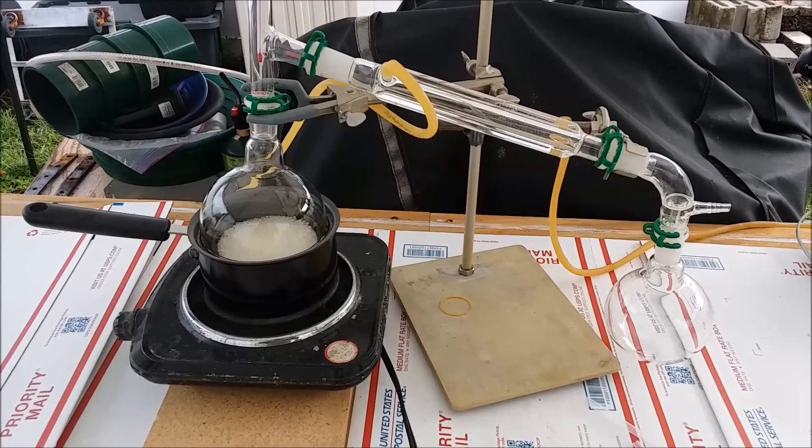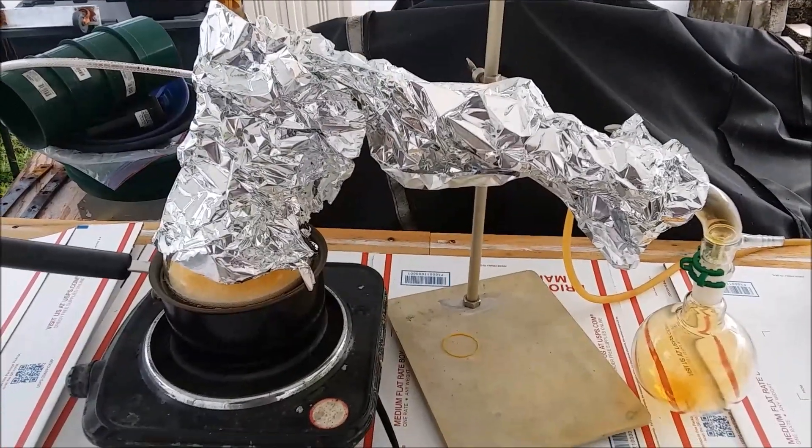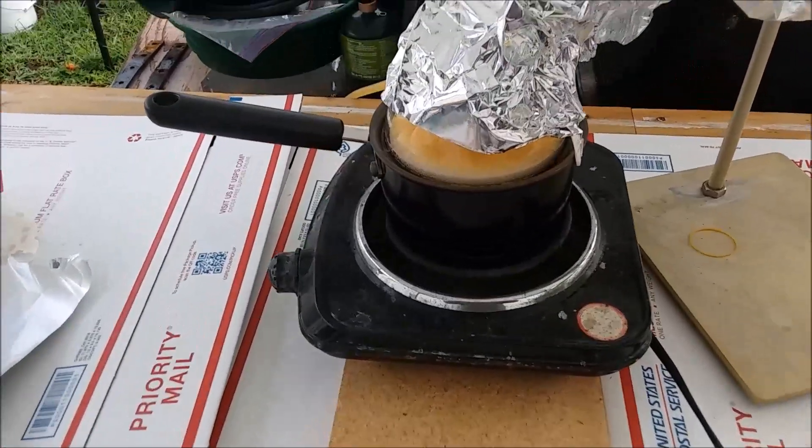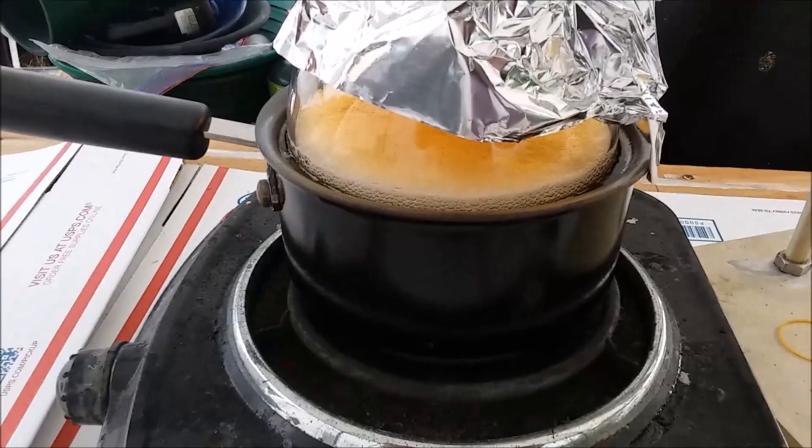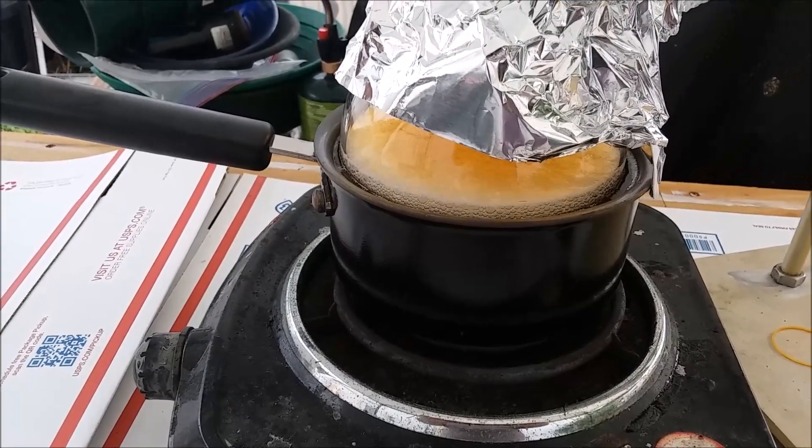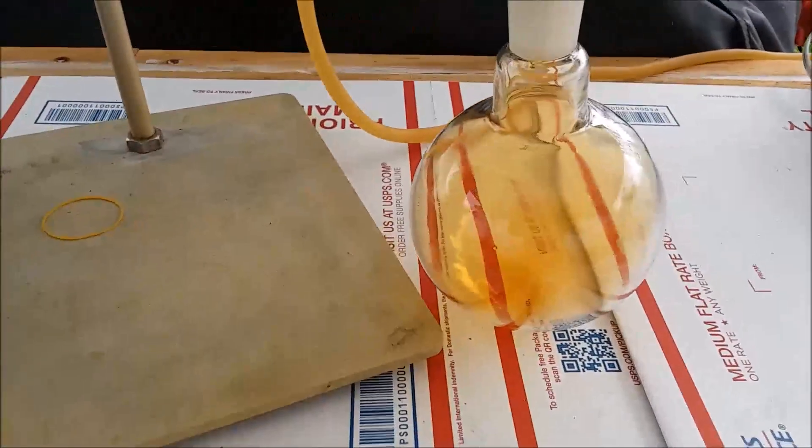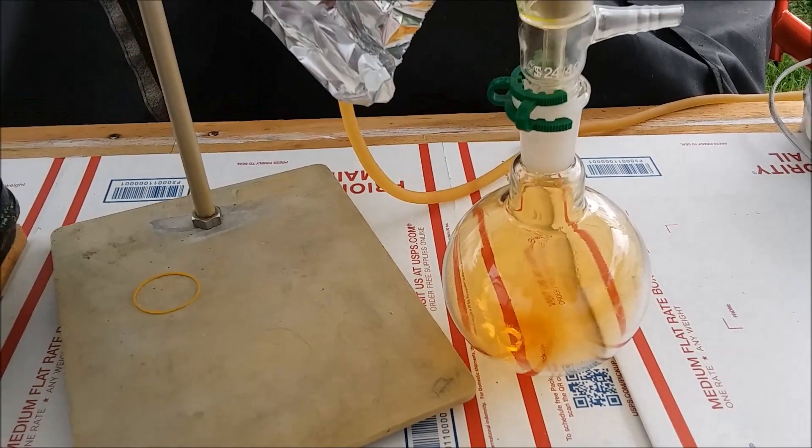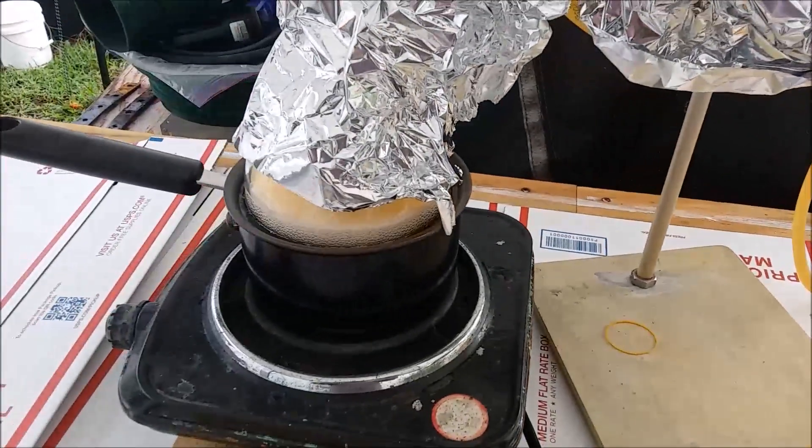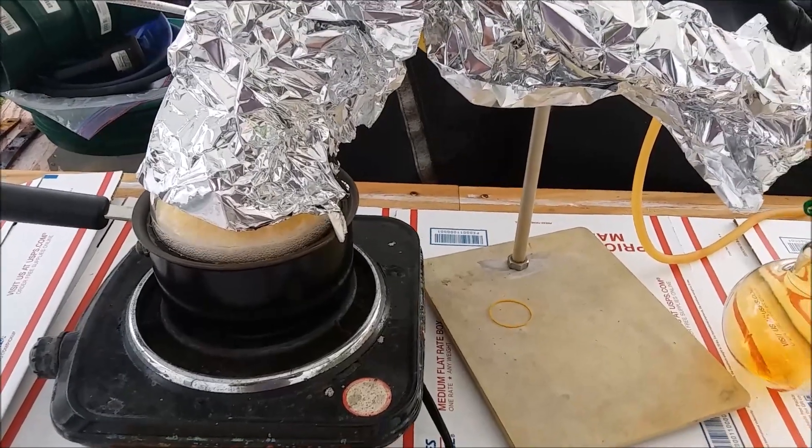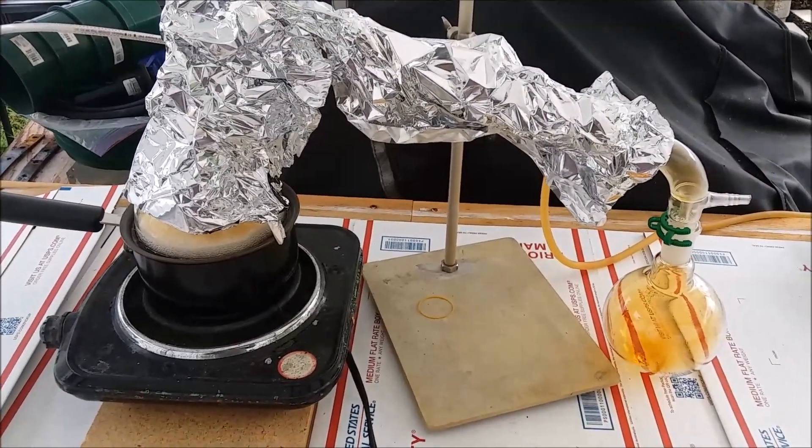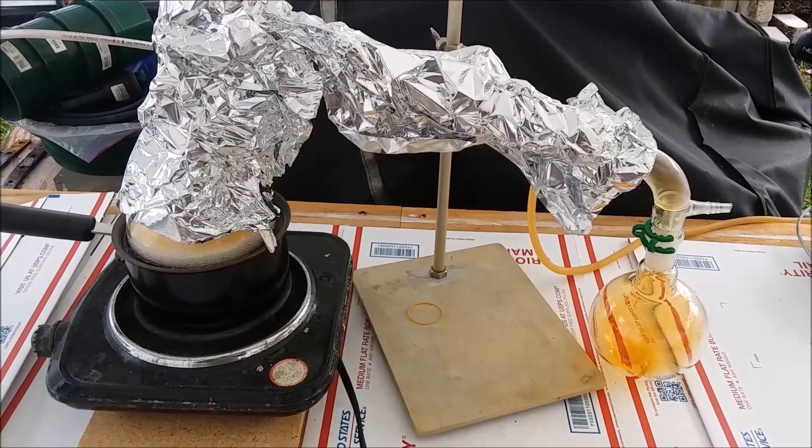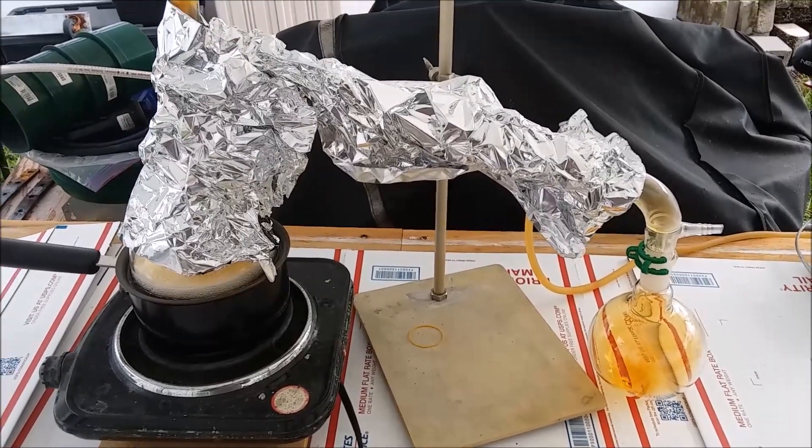It's just now starting to heat up. I put some aluminum foil insulation around it to keep heat in and light out. Things have heated up, got a pretty vigorous reaction going on in the boiling flask. I just turned the heat down because it's starting to look like it might be getting a little too vigorous. Oh, here we go, liquid coming across. Nice. I'm sure it's not pure nitric acid, but it'll be pretty concentrated. I will probably dilute it down to the 68% azeotrope.